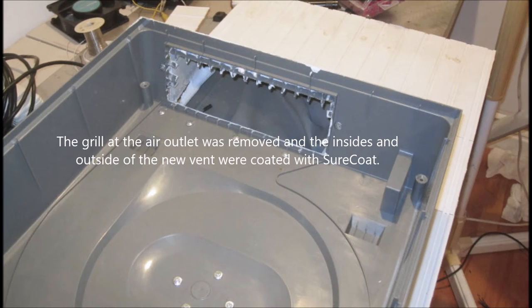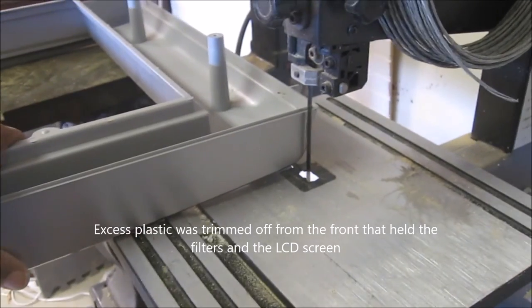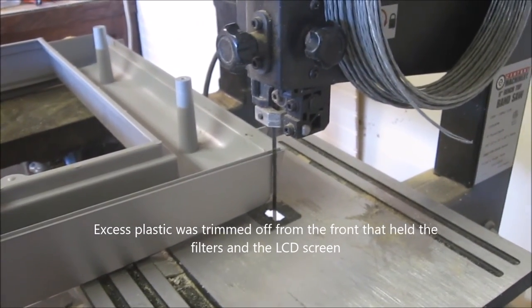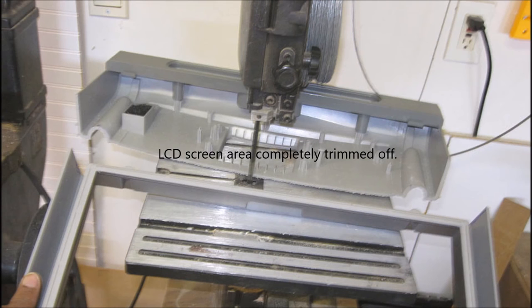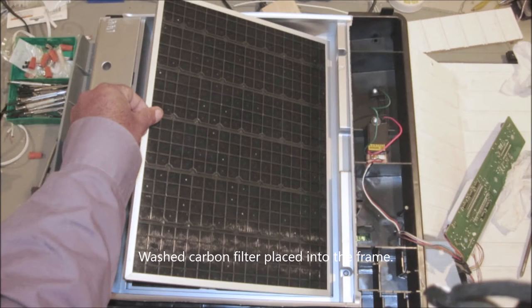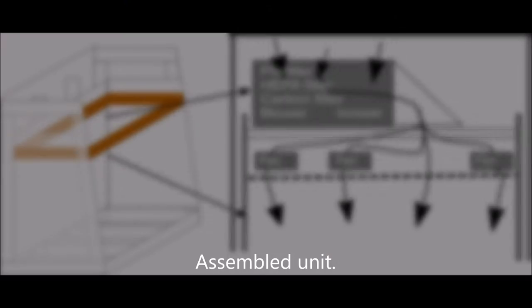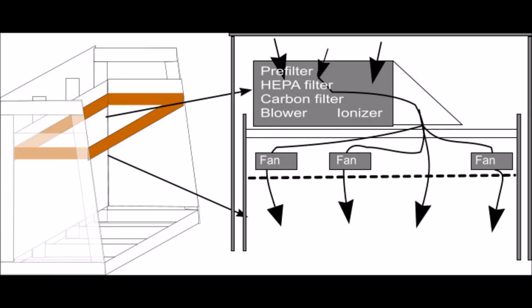I sealed both the inside and outside with SureCoat roofing compound — you can see the whitish material, totally sealed. Then I reattached the fan with its original screws. I couldn't fit the top frame exactly, so I trimmed it on my bandsaw, keeping just the frame part that holds the filters. I didn't need the electronics section on the right. I put the clean filters back in — the carbon and HEPA — and the pre-filter was attached later.